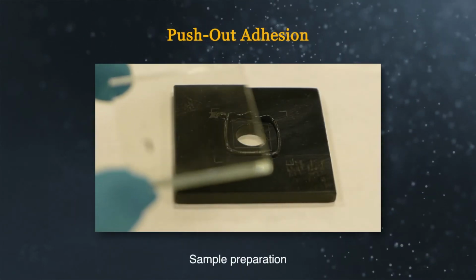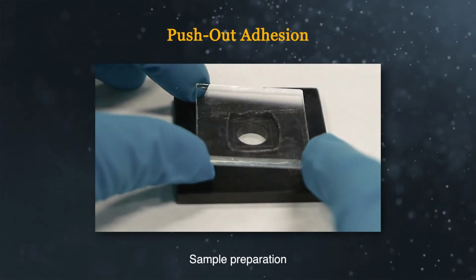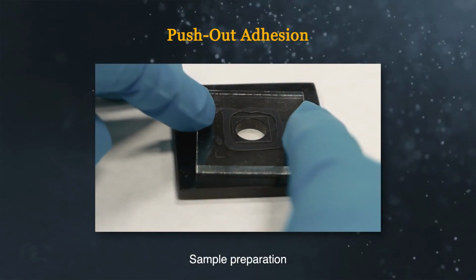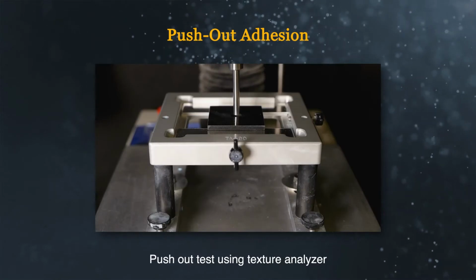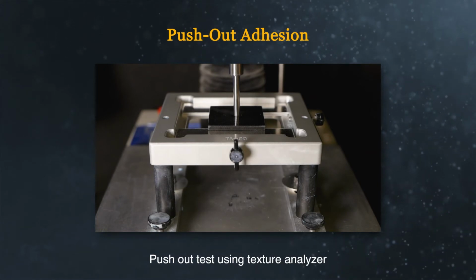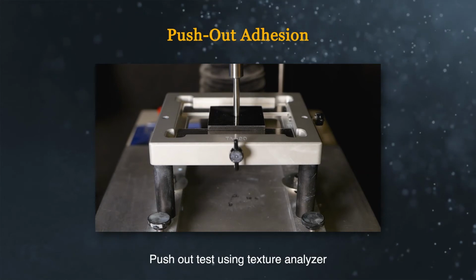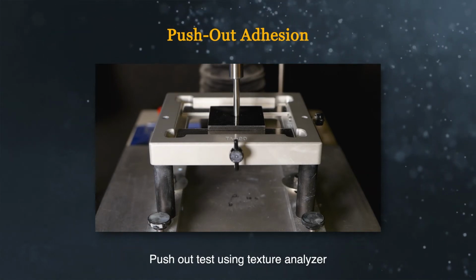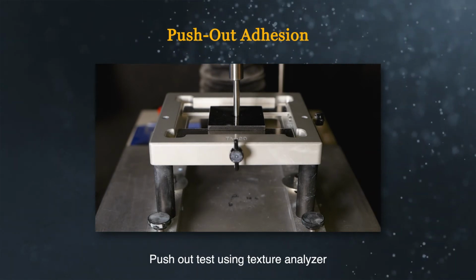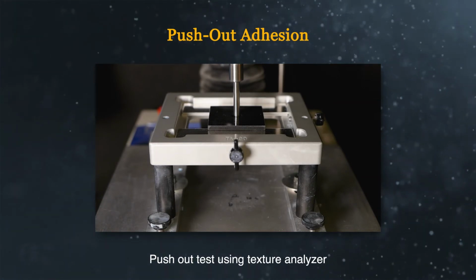Push-out adhesion testing is another method to measure a material's adhesive properties in gasket form. A material is dispensed around a circular window, and a top layer substrate is adhered to the gasketing material. After curing, a texture analyzer is used to push out the top layer substrate through the circular window, and the resultant forces are measured. Push-out adhesion is mainly used for hot melt products for applications where this more closely mimics actual application stresses. Hot melt adhesion testing can be done as soon as the adhesive cools, but strength will typically build over several days.